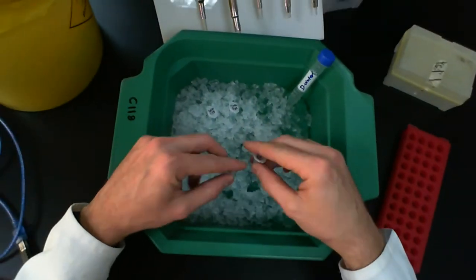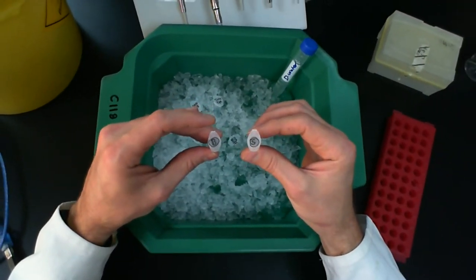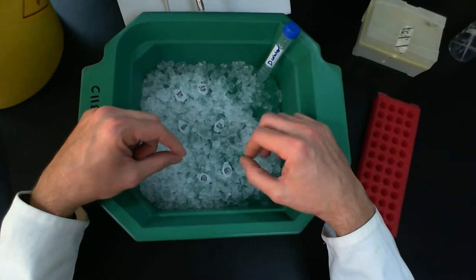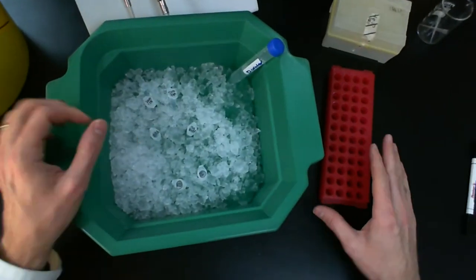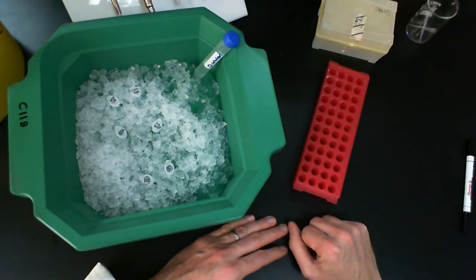You also have your two enzymes, the SmaI and your BamHI enzymes in here. They're not pre-measured, so you're going to have to pipette out the appropriate amount. Each of you has your own set of enzymes and so on, and there's also some water. We're going to set up these reactions, and you're going to see how we use these racks to help us set up the reactions.